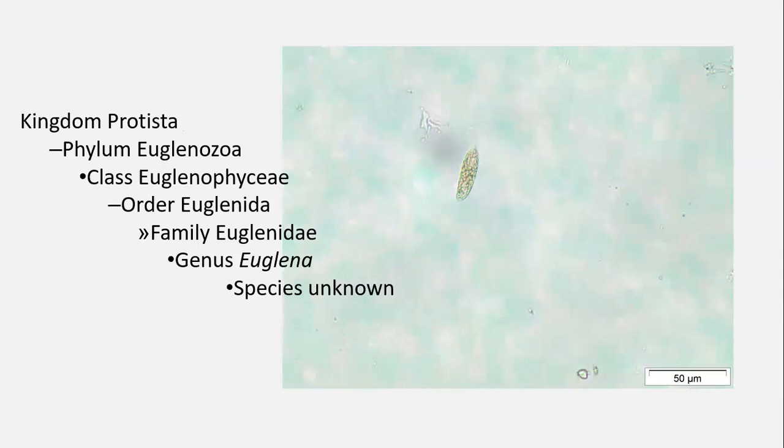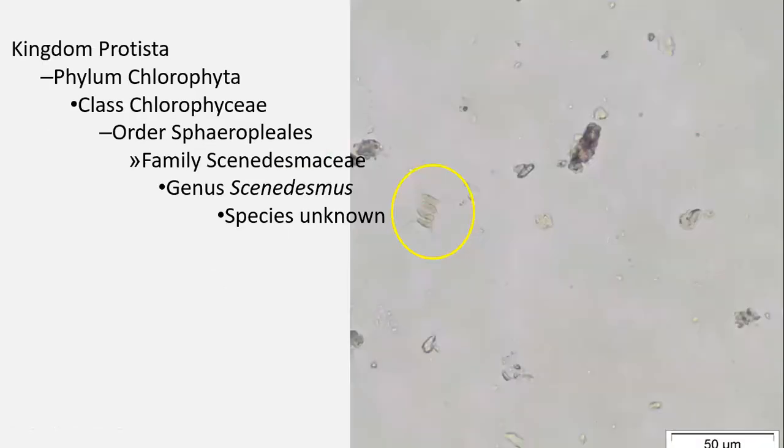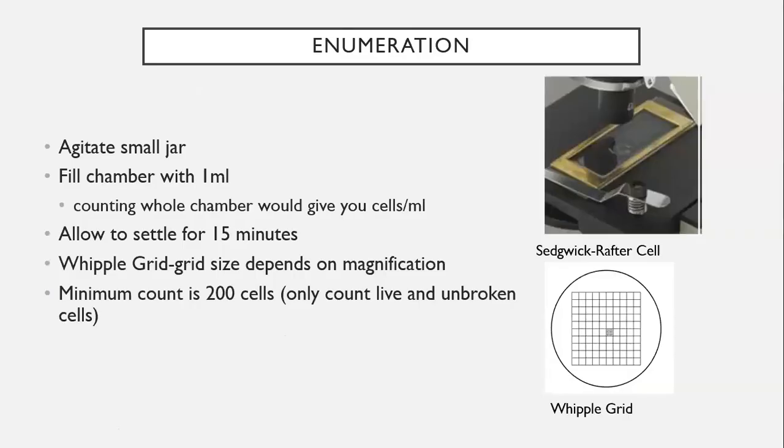Another example here of the phylum Euglenozoa. And so here we're looking at a euglenoid. And this last example here is a chlorophyta, which is pretty common in district waters. And this one is Scenedesmus. So you can see the different structure here compared to the others. It has these spines on them and this 4-layered ovals there. So those are just some examples.